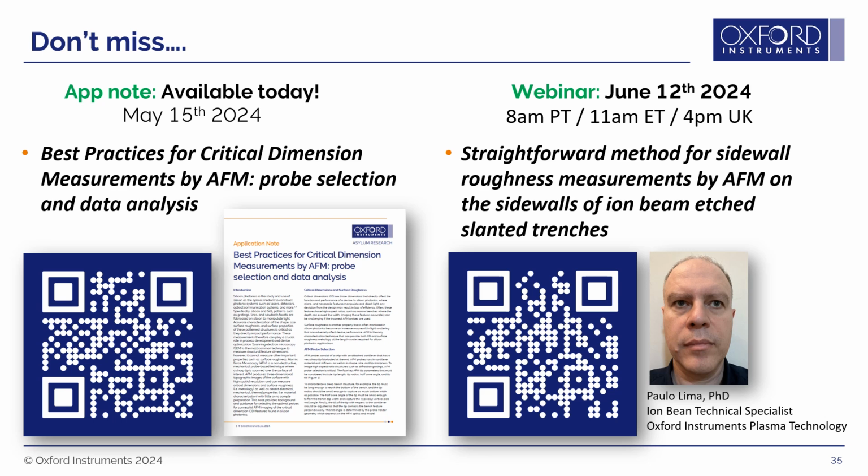Okay, another question. Can you talk a little bit more about why AFM is more accurate for measuring the trench depth than SEM? I think we saw some different numbers in the presentation, and which data set should we believe?